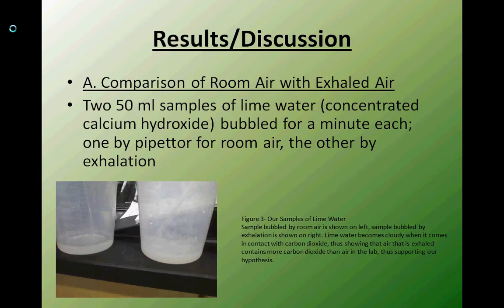Moving on to results and discussion. Part A of the experiment was comparison of room air with exhaled air. Two 50 milliliter samples of lime water, concentrated with calcium hydroxide, were bubbled for a minute each, one by pipetter and the other by exhalation.